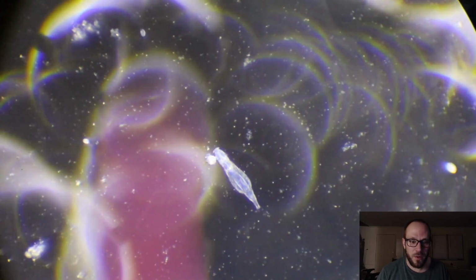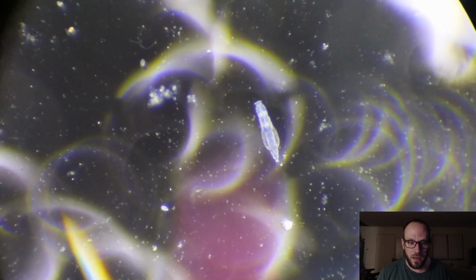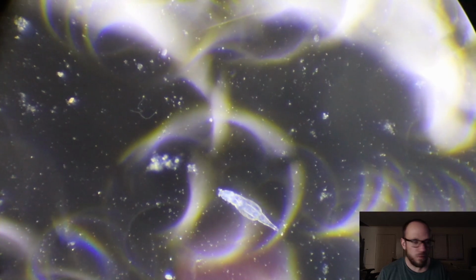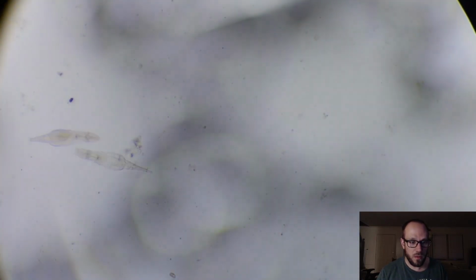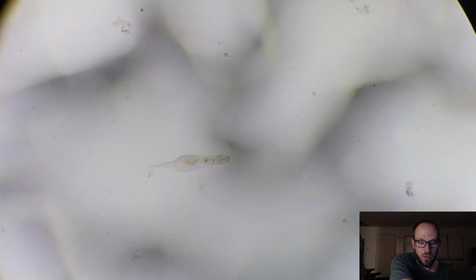But he's just inchworming along. He has the ability to cement his feet wherever he likes. And I kind of wish he would do the thing he does when he's looking for food. Let's go to Brightfield so y'all can see his different perspective. Boop. And so these aberrations you see are the water on the slide that needs to dry up. There's another one. This slide is just crazy with life.